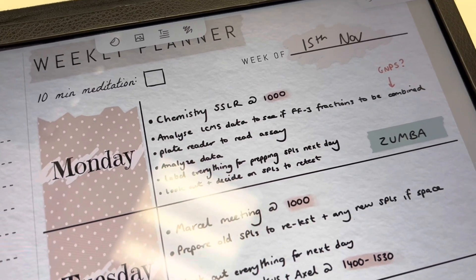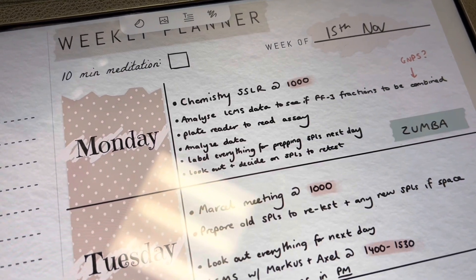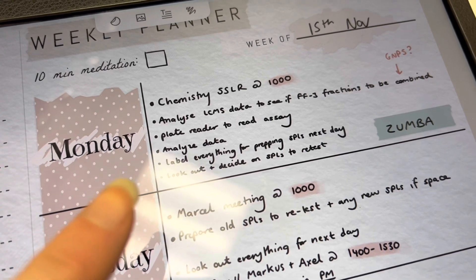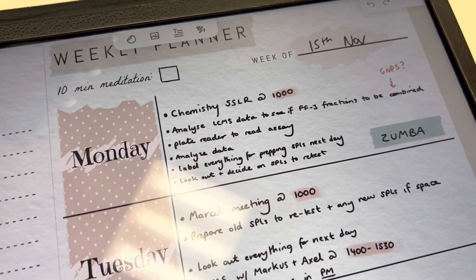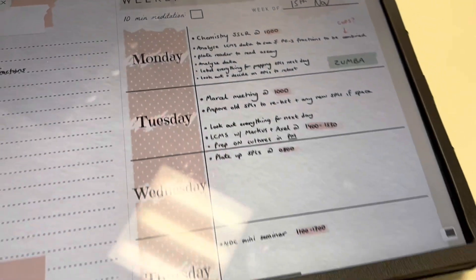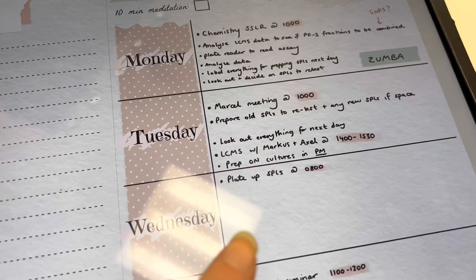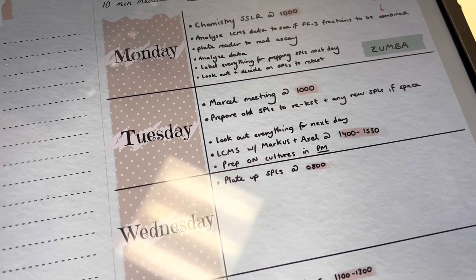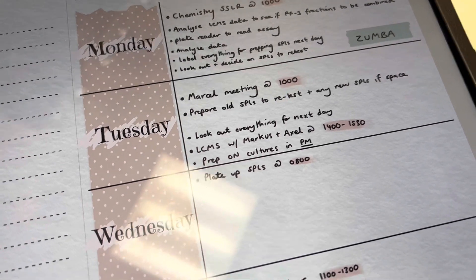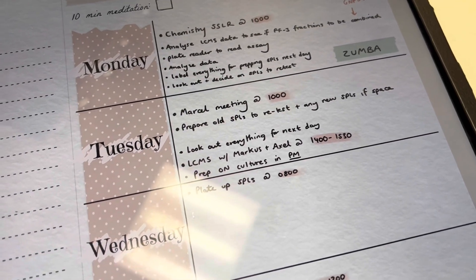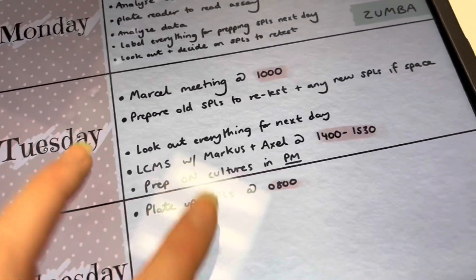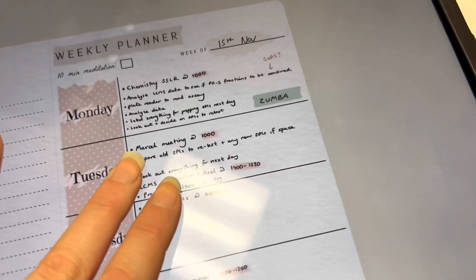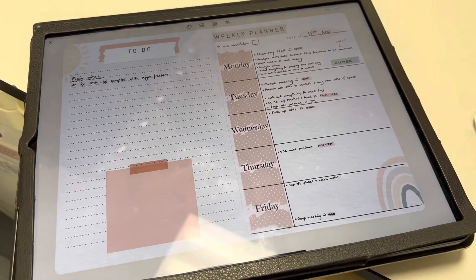After the LCMS analysis, I'm going to the plate reader to get results from the bioassay I did last week with the tributyl tin oxide, analyze that data, and label everything I need for preparing samples tomorrow - though I still need to decide what samples I'm actually going to prepare. Here's my schedule for the rest of the week; I tend to fill in plans as I go because things can change very quickly in science. Tomorrow is planned though, so that's fine.